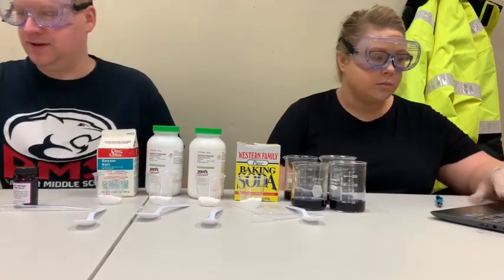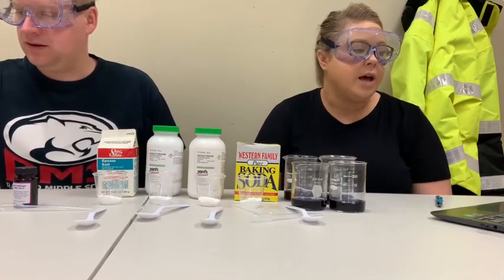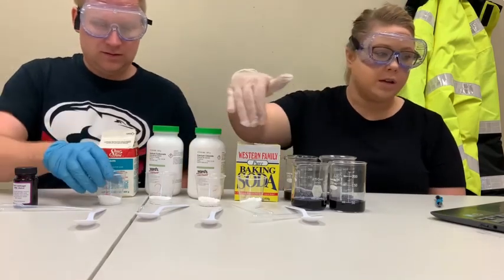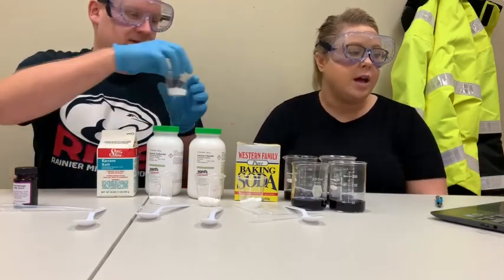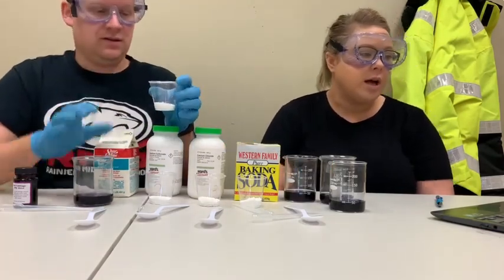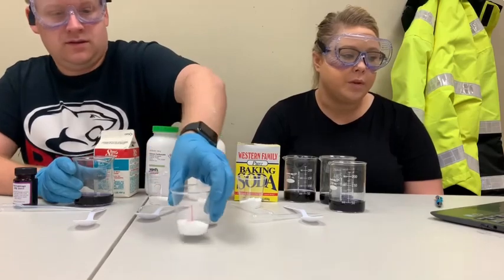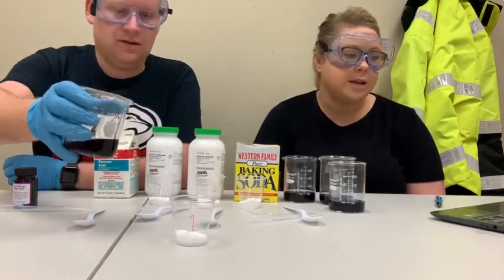So what's our first step? Step 1 says to obtain 200 milliliters of red cabbage juice solution in a 250 milliliter beaker. Obtain a small cup of each of the white powders, which we have done here. Step 2 says we're going to add 50 milliliters of red cabbage juice. We've pre-measured 50 milliliters of red cabbage juice in the cup labeled magnesium sulfate. Then we're going to stir with a clean spoon. While we are doing this, we're going to observe any changes that occur and record this in the data table on the next page.